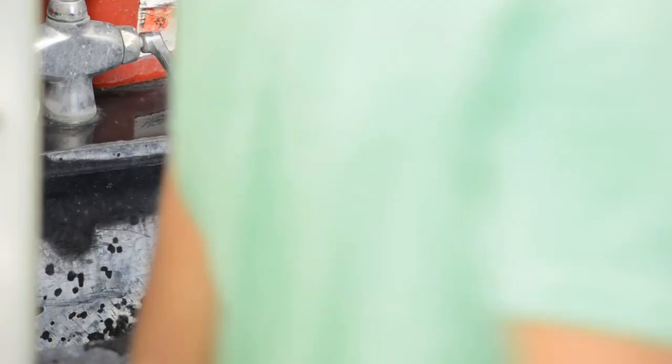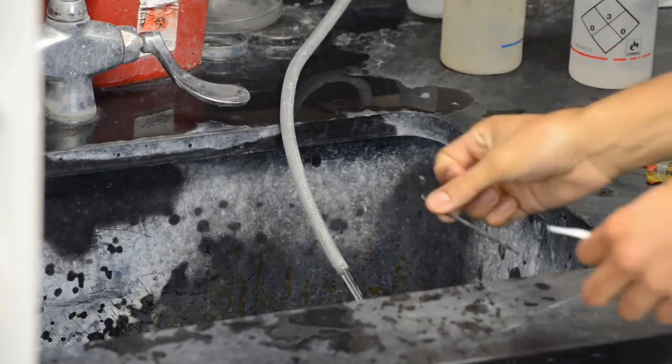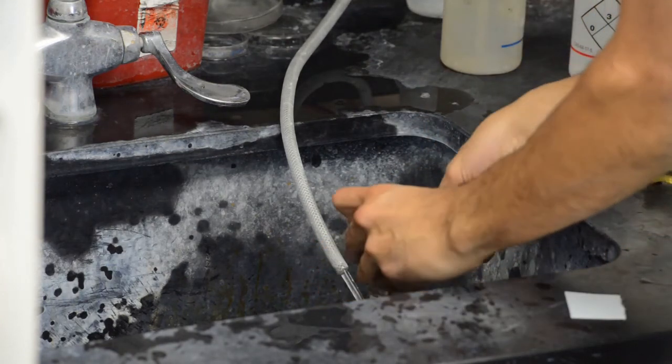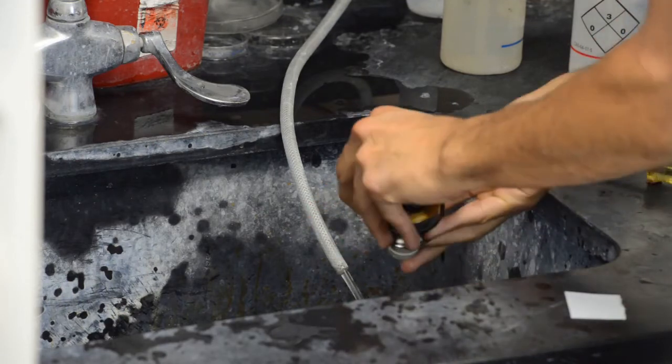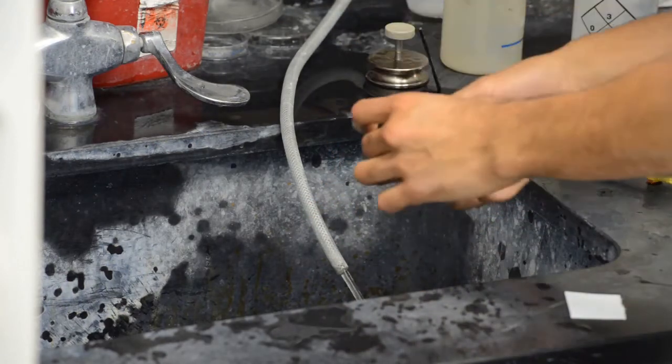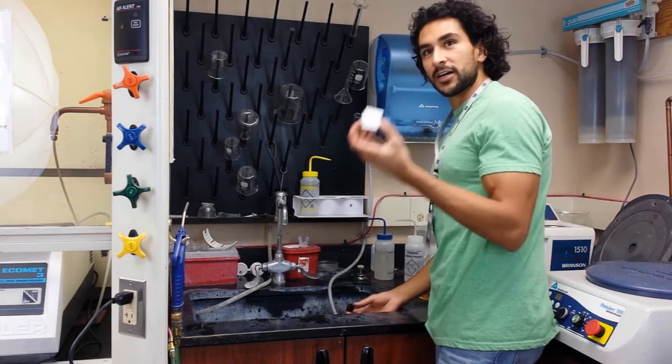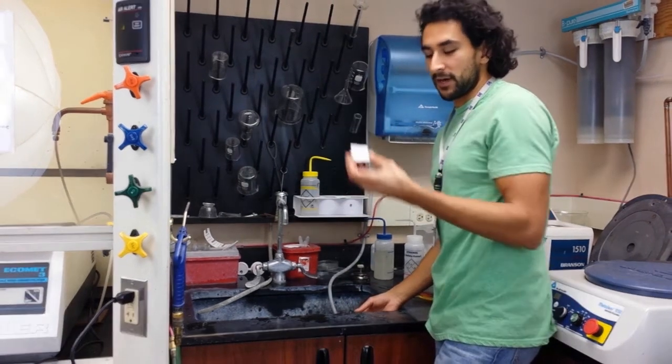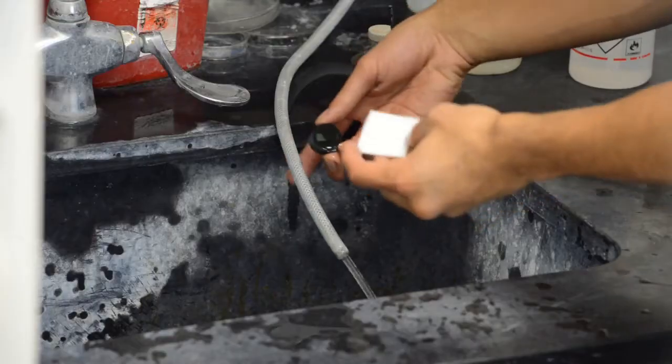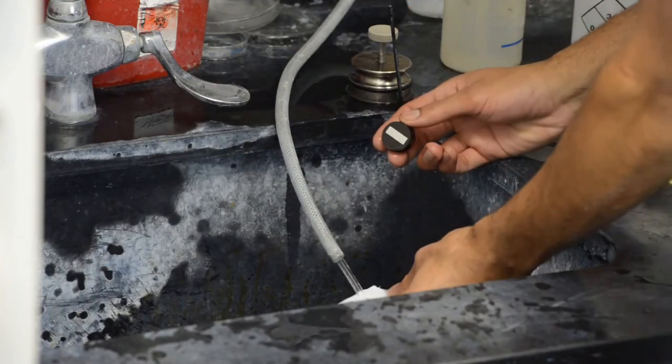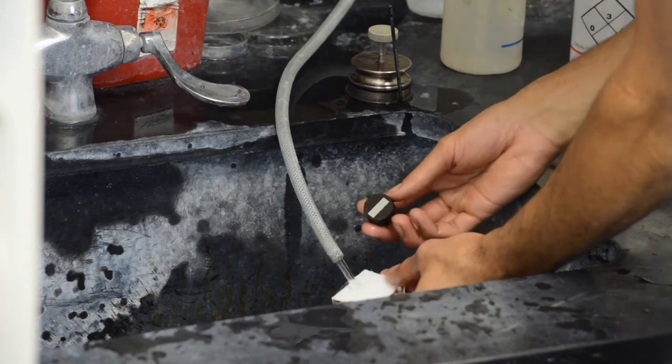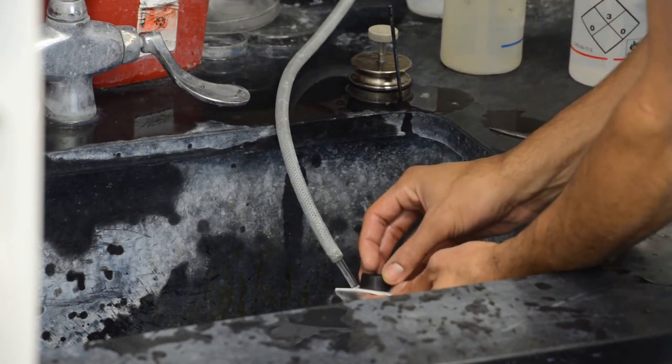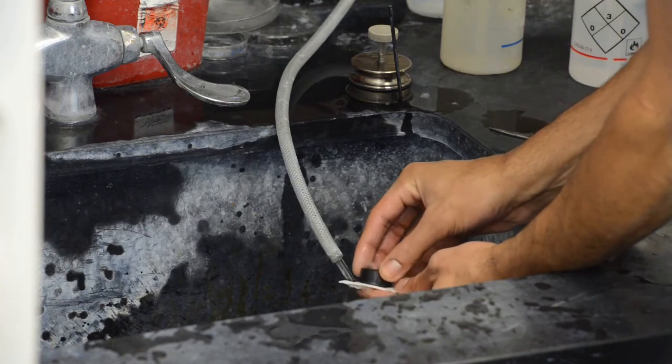And what you need is, well first, the Allen wrench to get out of it, out of there, and you need a piece of a pad. The same pad that is in the Vibramet right now. I've cut it in a small square, and we usually have some, a bag full of these around. And what you do is, you take this pad, you get it wet first.